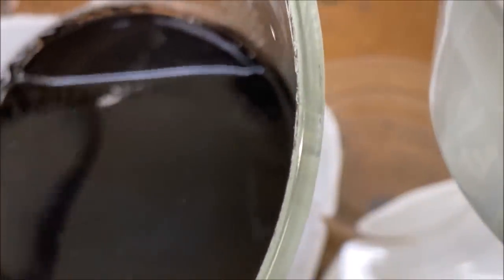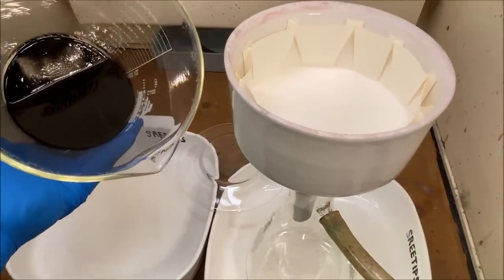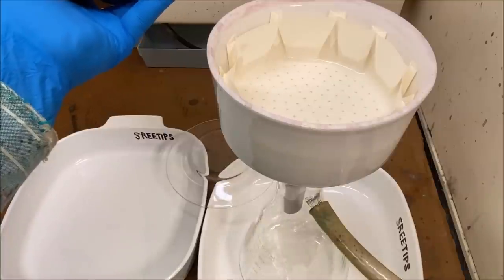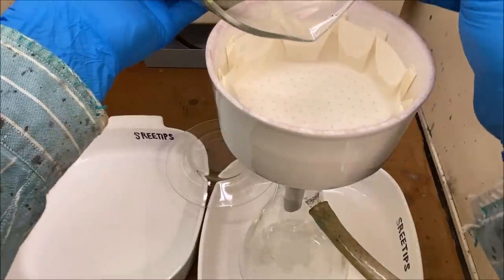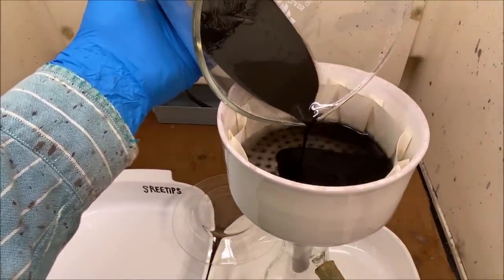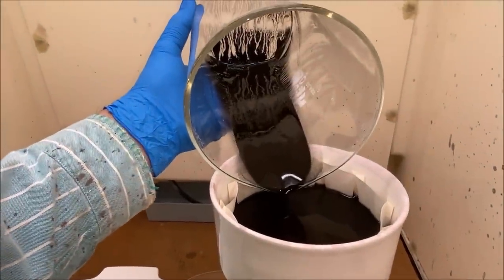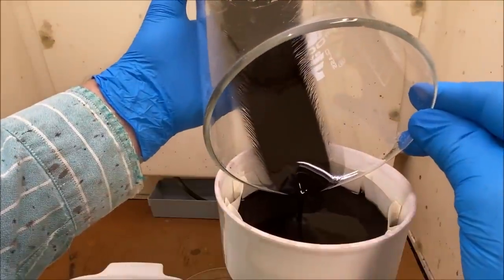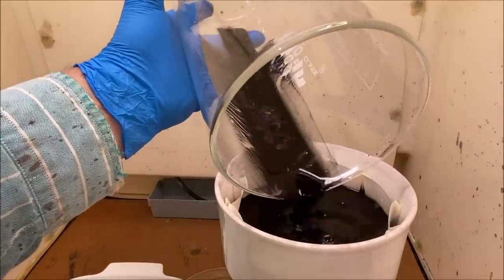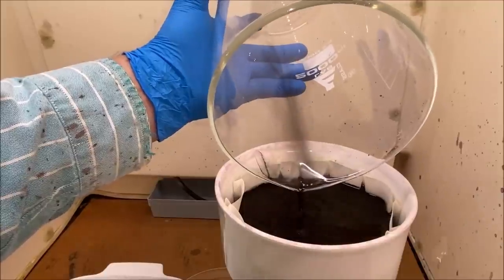And what we're going to do now is, there's going to be hydrochloric acid in there no matter how many times I try to rinse this out. So we're going to collect these solids now in a filter. Get this wet. I've got my specially prepared filter that rides up the edges of the funnel so we can capture 100% of this material. Oh yeah, look at that nice clean black material. There's going to be hydrochloric acid in here, so the only way to defeat that is to collect these solids in a filter, and then we're going to burn this.